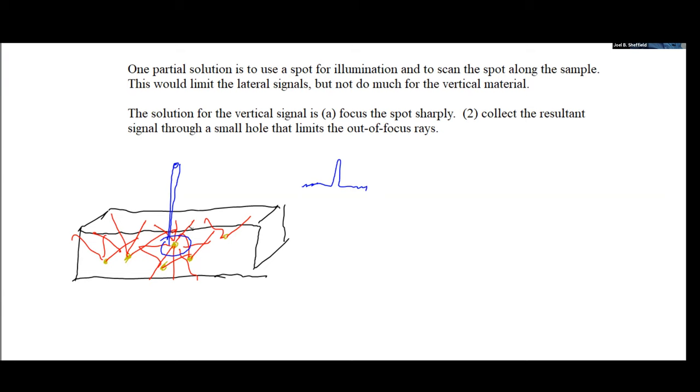Well, what I can do optically turns out to be an interesting solution, which is now number two on this list, which is to say, okay, there's going to be this sort of spread of light that comes off even when it hits my own sample. So I'm still going to have some light that comes off that will basically blur out some of what I've been looking at.